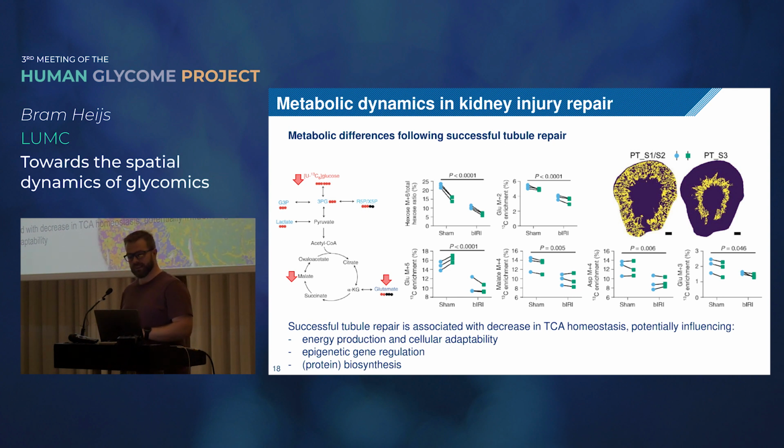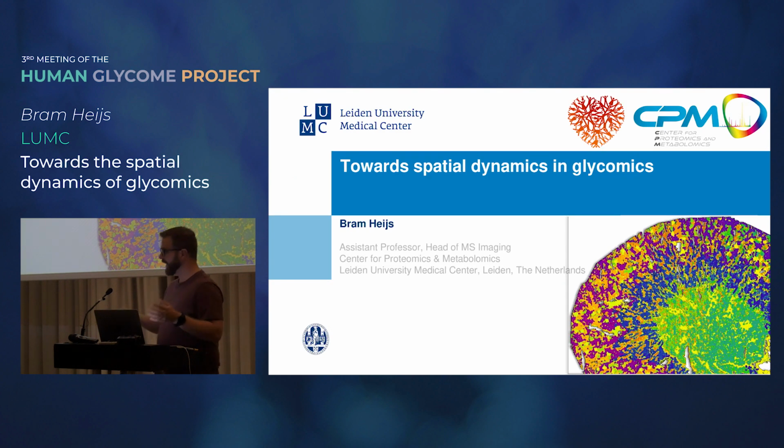So now, coming back to why we are all here, and that's glycomics. This, I said, was going to be a stepping stone towards how we can actually target to look at the spatial dynamics of glycosylation.